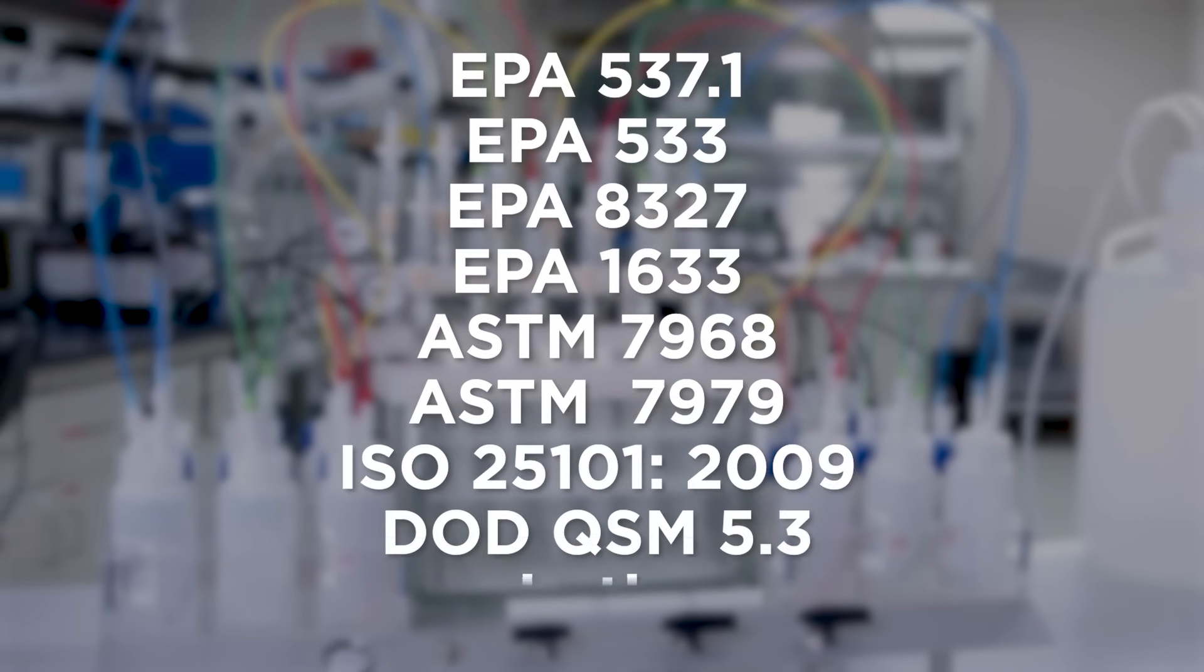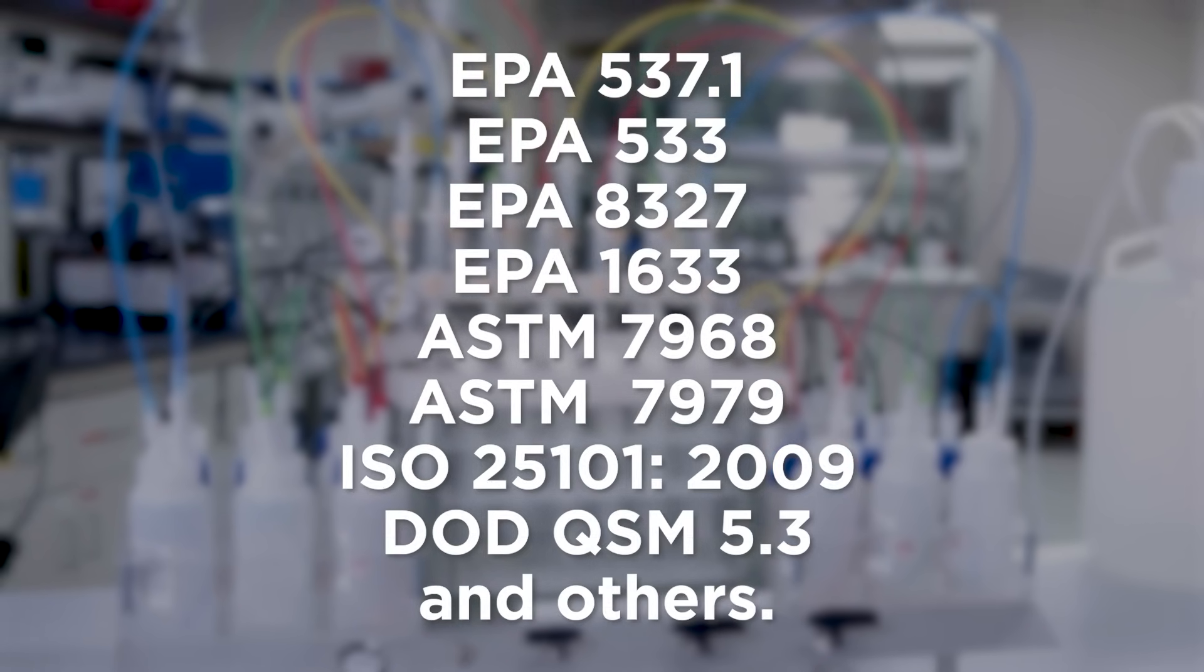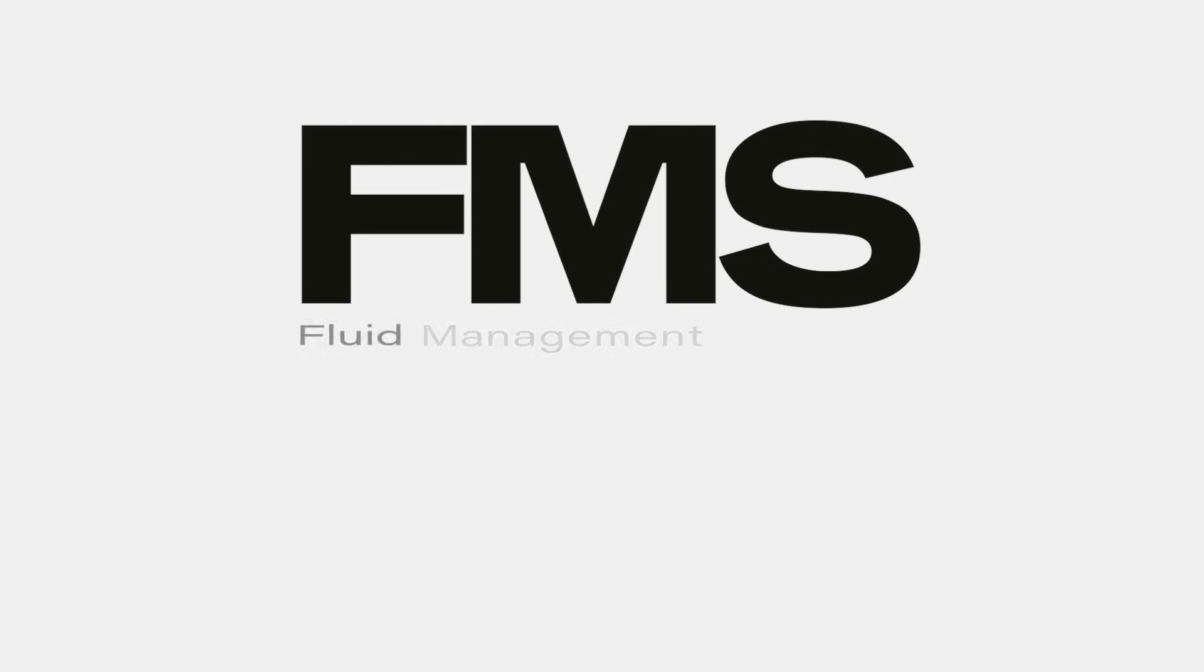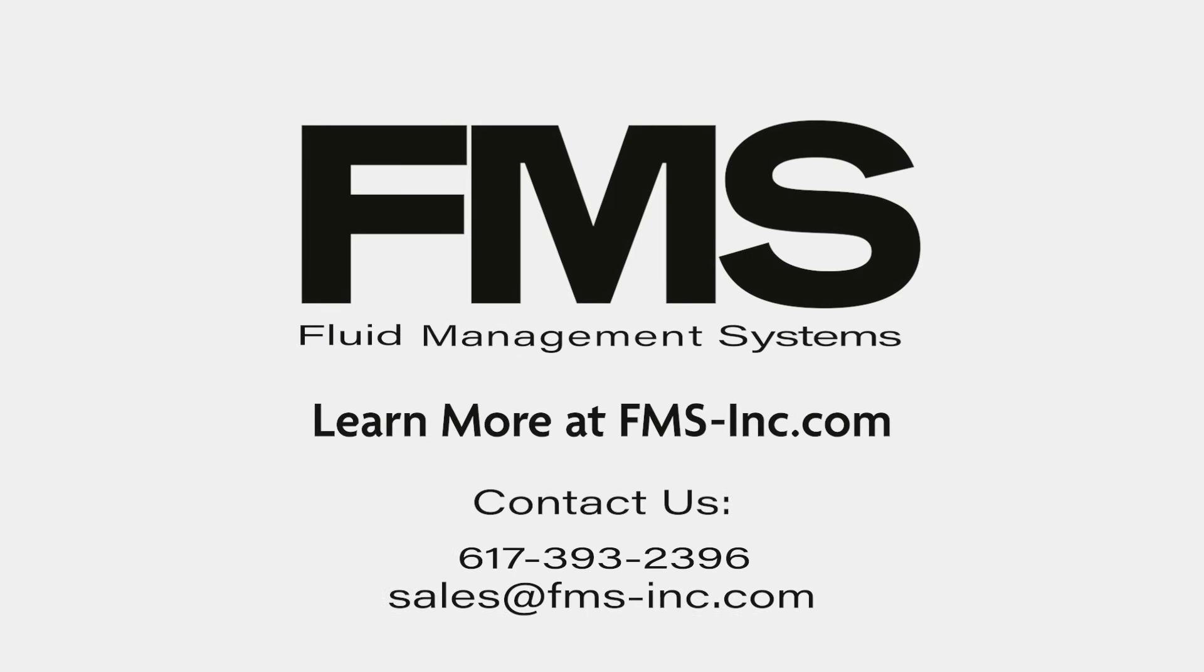Easy PFC, SuperVap, PFC concentrator. Designed for improving the laboratory's workflow of PFAS extractions in all water matrices.